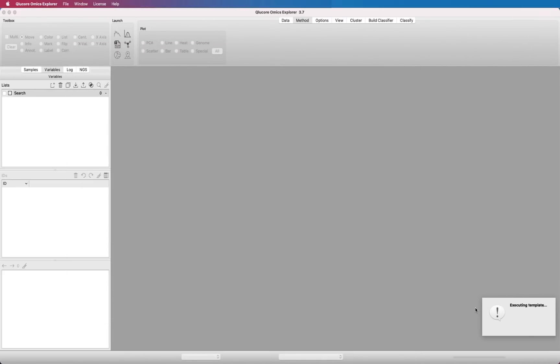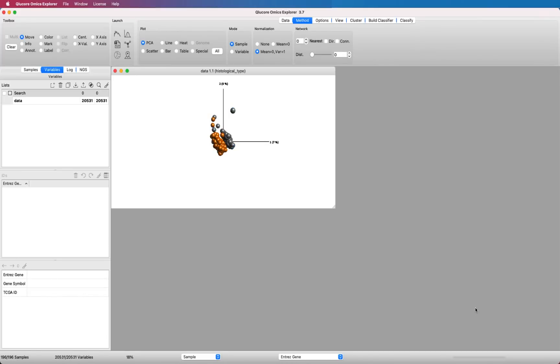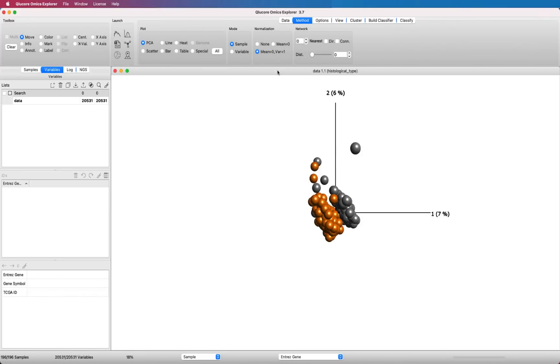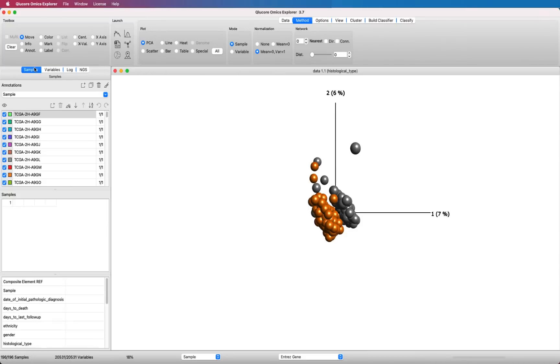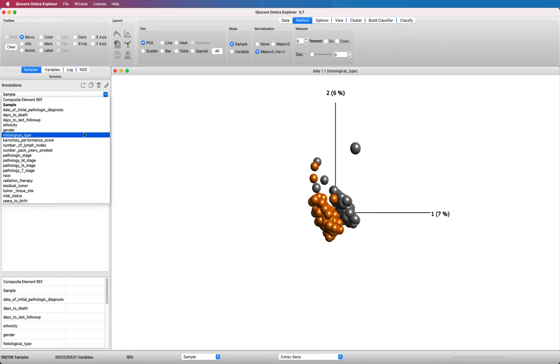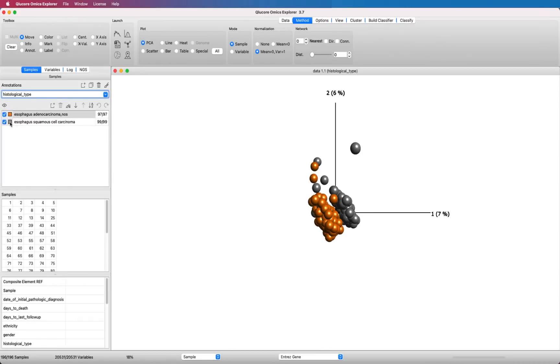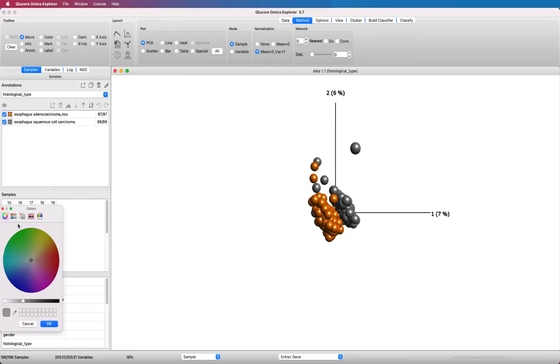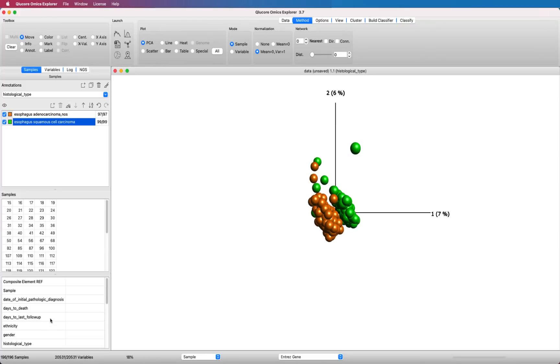The dataset opens up in a PCA plot already colored according to histological type. If you go to the sample tab, you can have a look at all the sample annotations that are included in the dataset. You can change the colors by finding histological type in the sample tab and then just double clicking on the color you want to change and select another color. Or you can color according to something else.